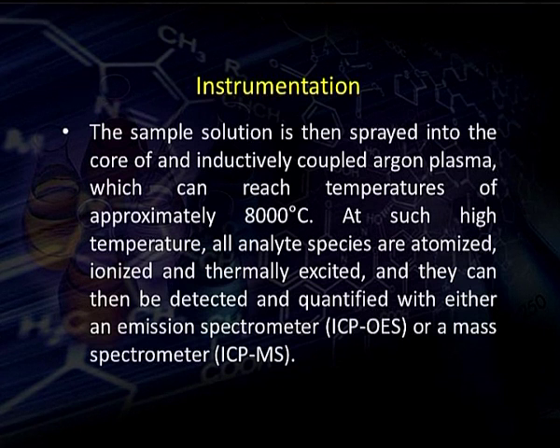They are then ionized and thermally excited, and then they can be detected and quantified with either an emission spectrometer, that is ICP OES, or a mass spectrometer, ICP MS. So, these are the integration of two techniques, or we can say the combination of two different techniques.